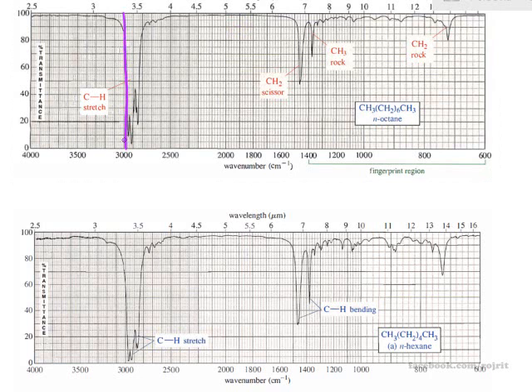Normally this is the borderline to distinguish between alkane, alkene, and alkyne. So if the absorption is under 3000, this is the characteristic absorption peak of the alkane, which is actually the sp3 carbon stretching with the hydrogen atom. So it's the alkane. I will remark here: sp3 carbon single bond with hydrogen, alkane.